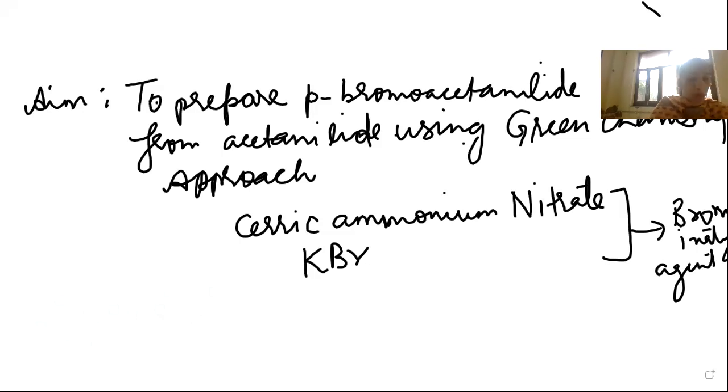So we will be needing ceric ammonium nitrate and potassium bromide. Moreover, this reaction is carried out in aqueous solvent.